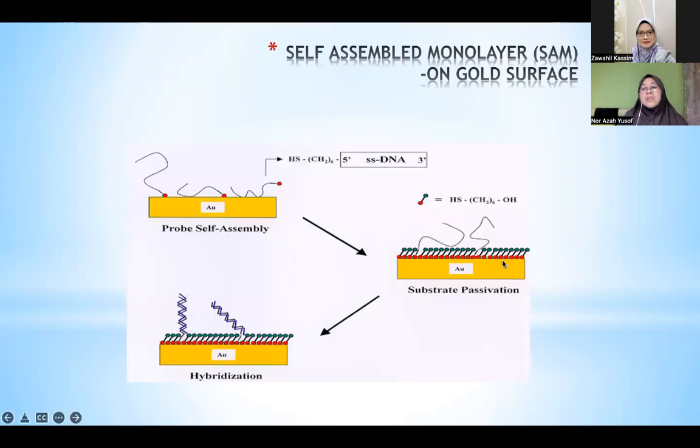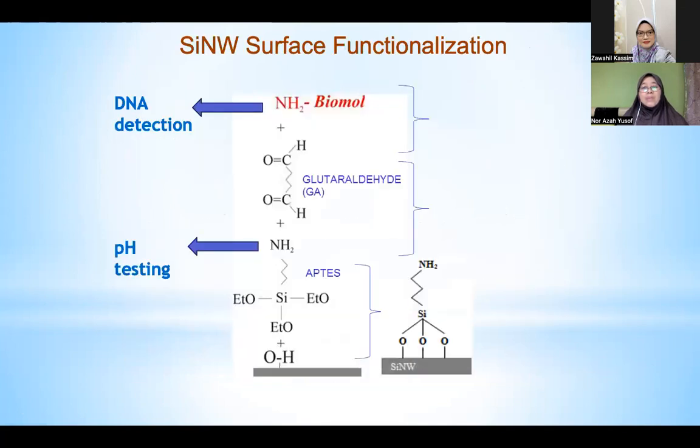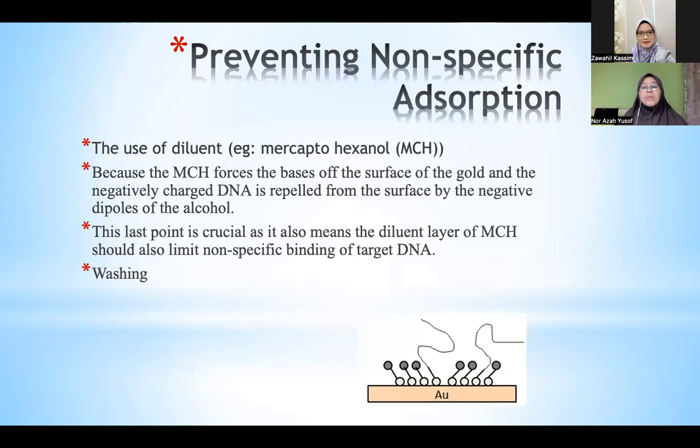The spacer is negative in charge. One thing about organic material: when we extract from blood, plants, or microbes, most of the proteins and most of the DNA are negative in charge. So if we can passivate, or put a negatively charged functional group on top of the sensor surface, this helps to repel the unwanted species. That's the most that we can do at this moment: surface passivation to repel the unwanted species.